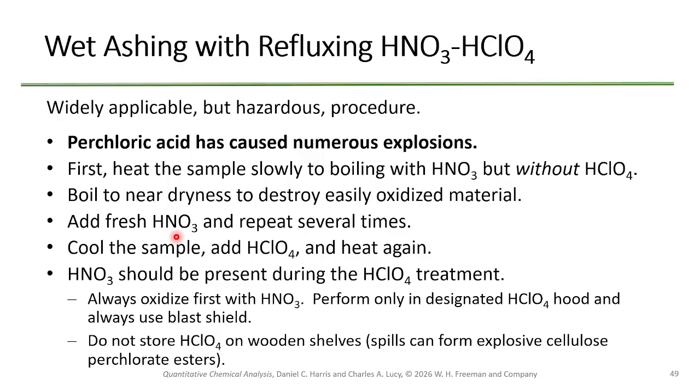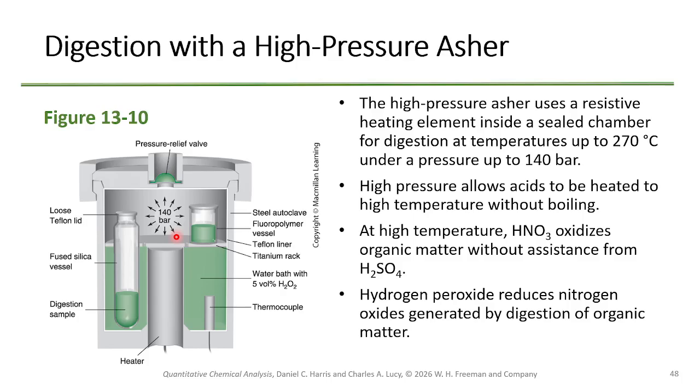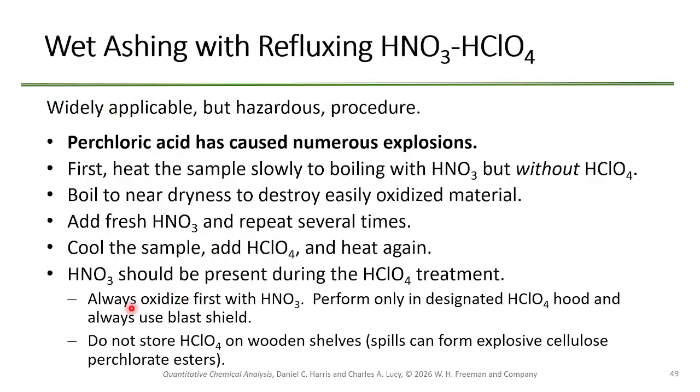Perchloric acid has actually caused numerous explosions in these. If you use perchloric acid here, you can boil all of this off at this very high temperature and high pressure that you're doing this at, and then if that gets too dry, it explodes. And so you can have these blow up if you use perchloric acid.